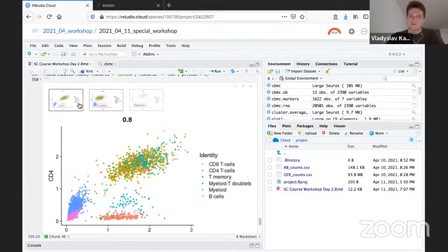I just don't know what it means. I never paid attention that there is some number on it. I assume that, like in regular regression analysis, it is the coefficient for the line. So the bigger this number is, it means that all of these cells on this medium diagonal line... basically correlation level or what? Yeah. Okay, good. I see that somebody wrote it also in chat.